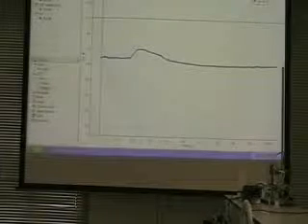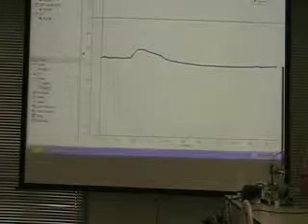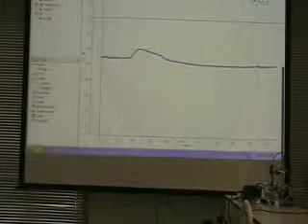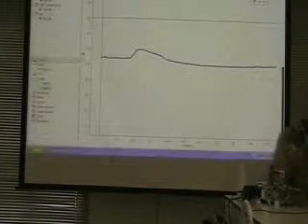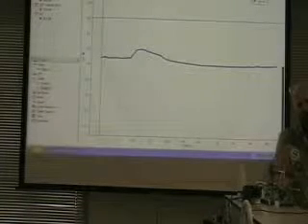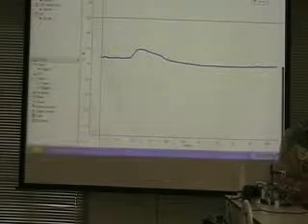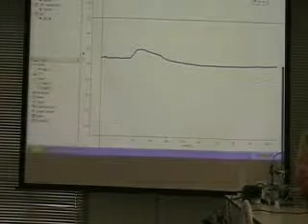Well, one thing that messes with the current, of course, is bubbles, because the bubbles are gas, and the pH probe is designed to work purely in a liquid. So the fact that I've used calcium carbonate to produce carbon dioxide means that my pH probe is going to give me anomalous readings.